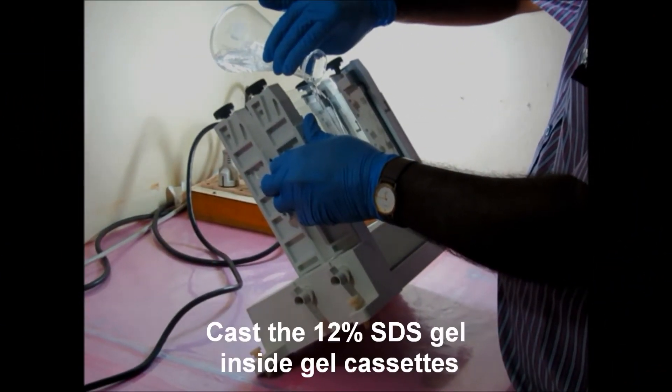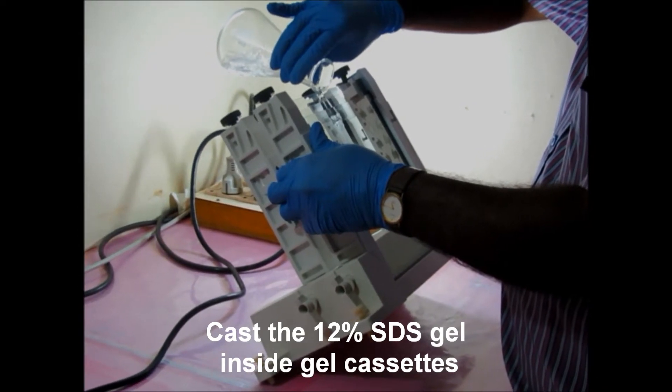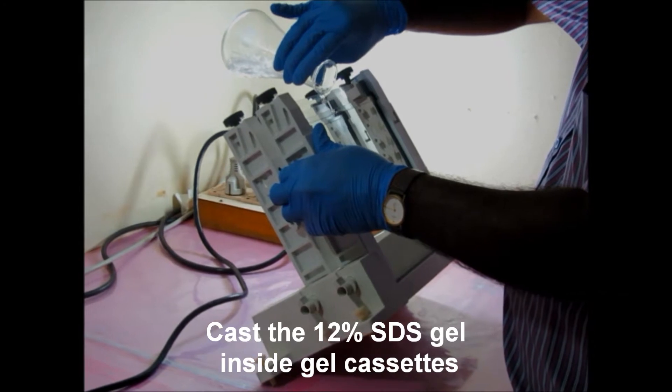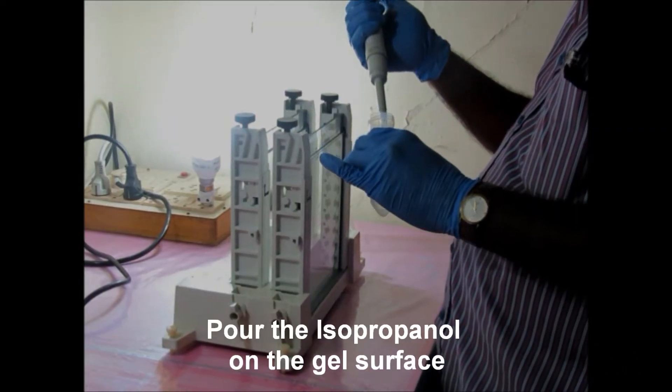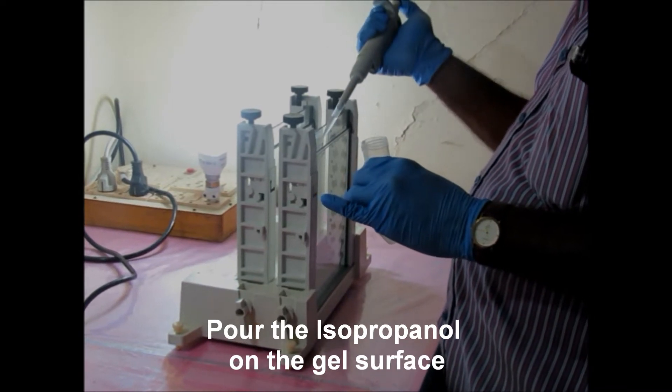In the second dimension, the first step is to cast a 12% SDS gel inside the gel cassettes. Slightly pour isopropanol on the gel surface.